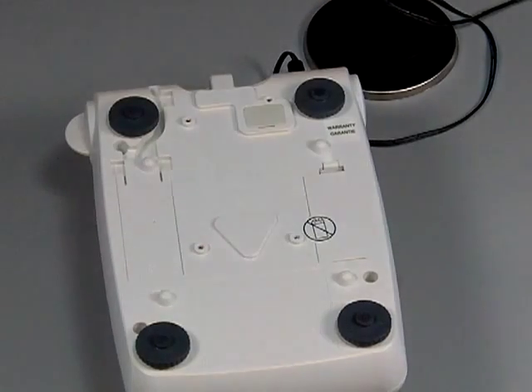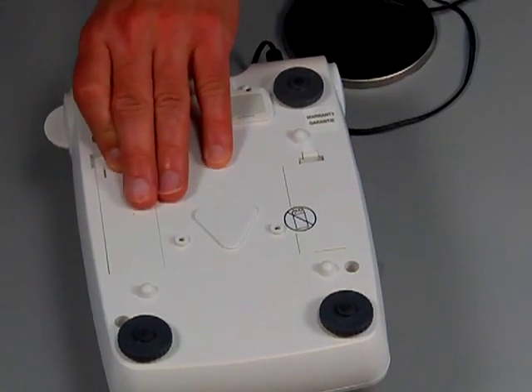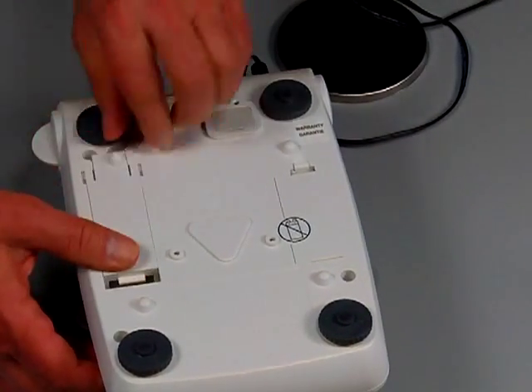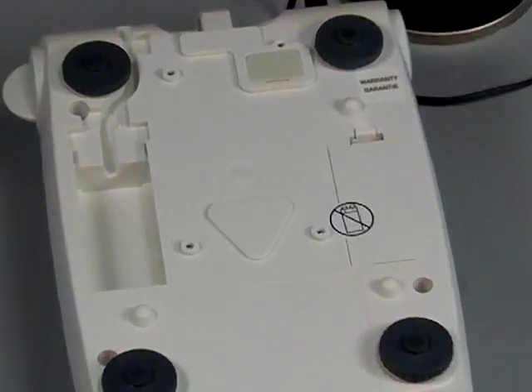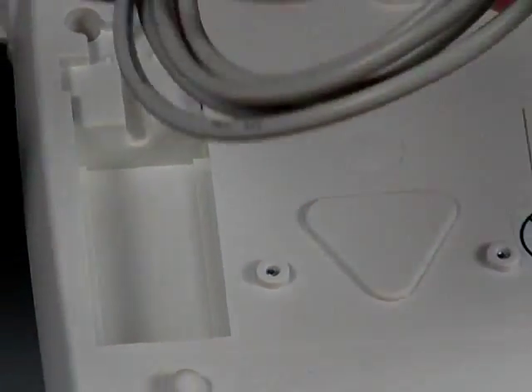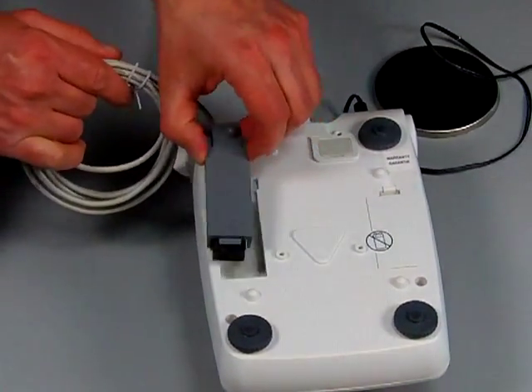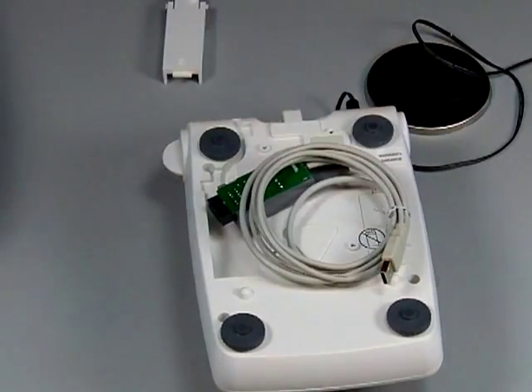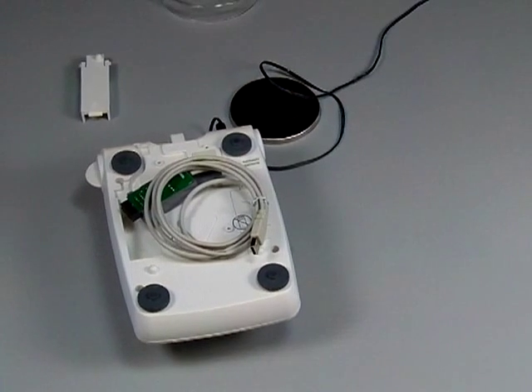The other feature the scale has is the ability to plug in a USB or RS-232 port. So this little compartment here, basically you open this guy up and there are modules. Now these modules are optional accessories. This happens to be the USB interface, and that interface simply slides right in and you just push forward. This is the USB module and there's a driver that needs to be loaded because they are emulating the USB, so it's not a true USB.